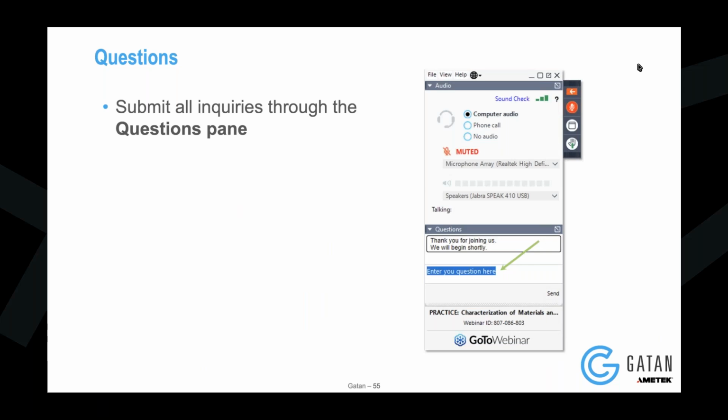I can take this question. So ptychography is an algorithm by which you're processing your 4D STEM data. You're recovering these nice high signal to noise images in the end that contain information, for example, about your light elements. And these real space images that you're seeing reconstructed from the ptychographic data come from the 4D STEM data itself. So it's a little bit different than just taking a 2D real space image and then applying some post-processing to get a nice image at the end. The real space images you're seeing are coming from reconstructing the 4D STEM data with these different types of phase retrieval approaches.